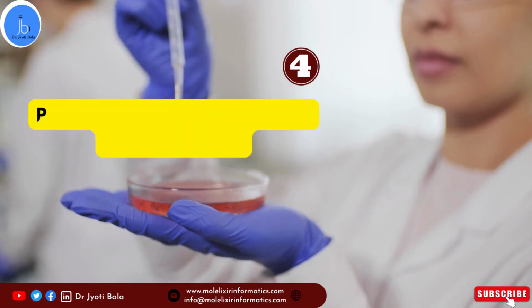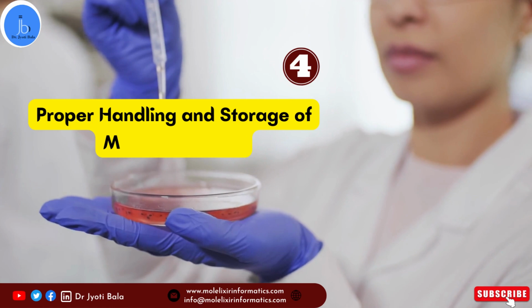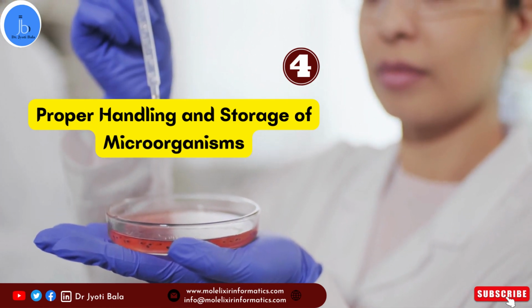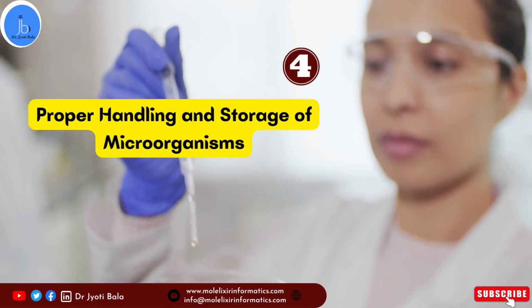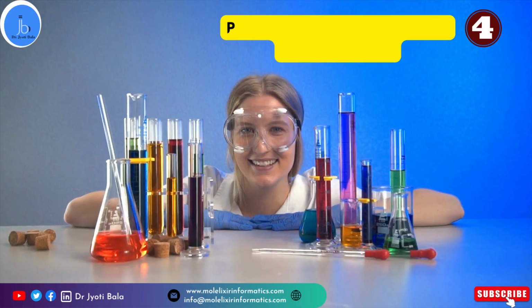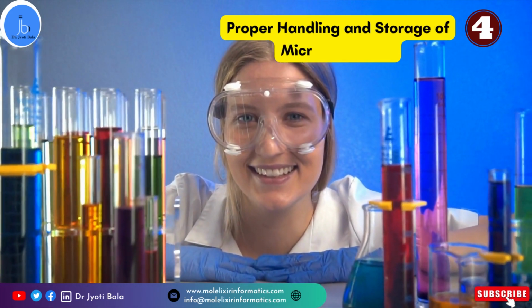The fourth is proper handling and storage of microorganisms. When working with microorganisms, it is crucial to follow guidelines for their safe handling, storage, and disposal. Label and store cultures appropriately and handle potentially hazardous microorganisms with caution.